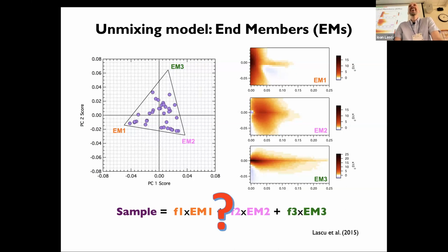The assumption is that the end members are fixed in all samples. Yeah, exactly. And the other thing that we're doing here, we're doing the PCA directly on the FORC diagrams, and so not all the processes are captured in the FORC diagrams. For example, reversible processes.